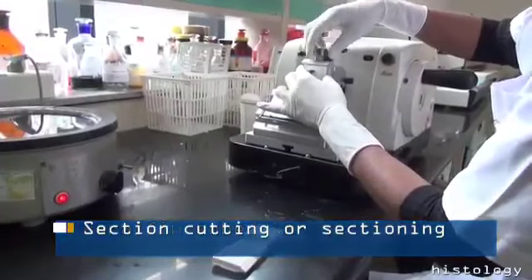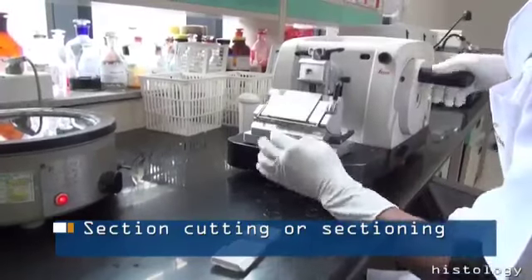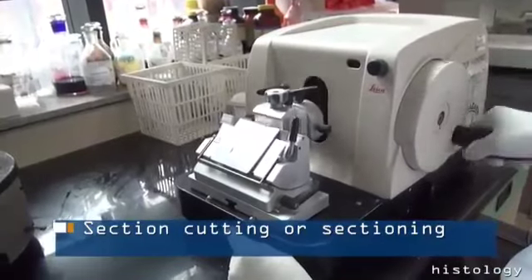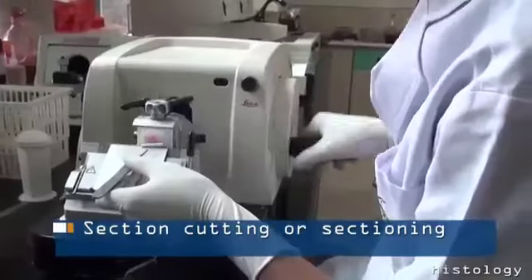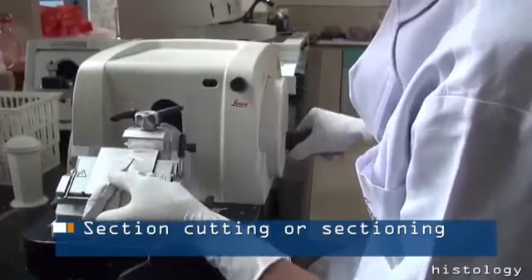Section cutting or sectioning. Once the paraffin has solidified, the tissue block is removed from the mold and placed on the microtome. In the microtome, due to friction between the knife and the paraffin block, enough heat is generated by the cutting action that it allows the tissue section to adhere to each new section and forms a ribbon of sections.